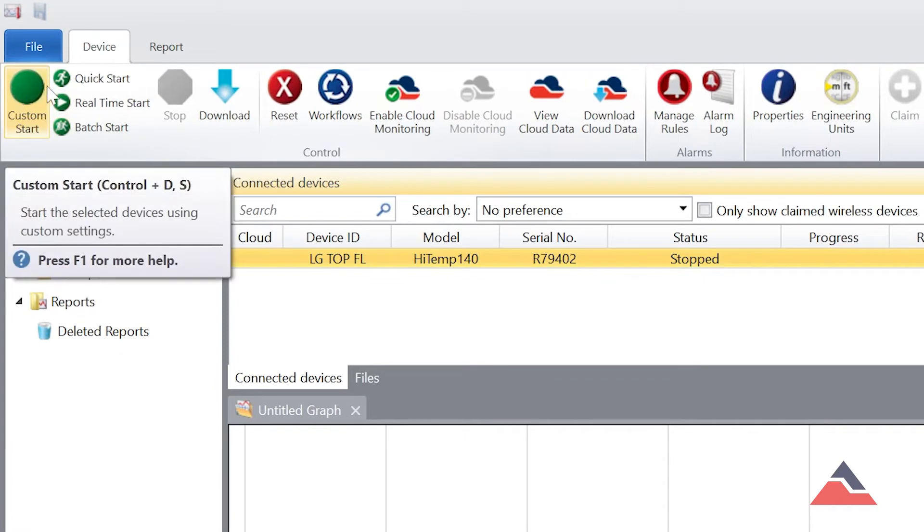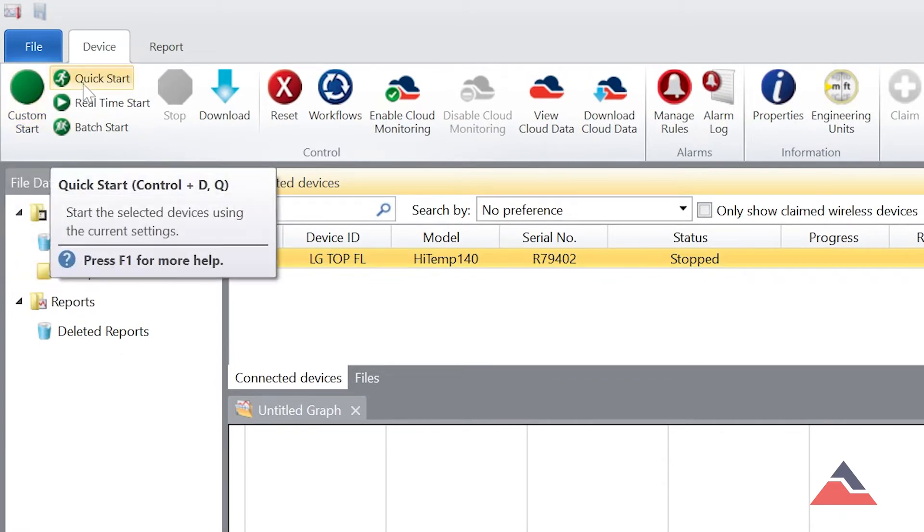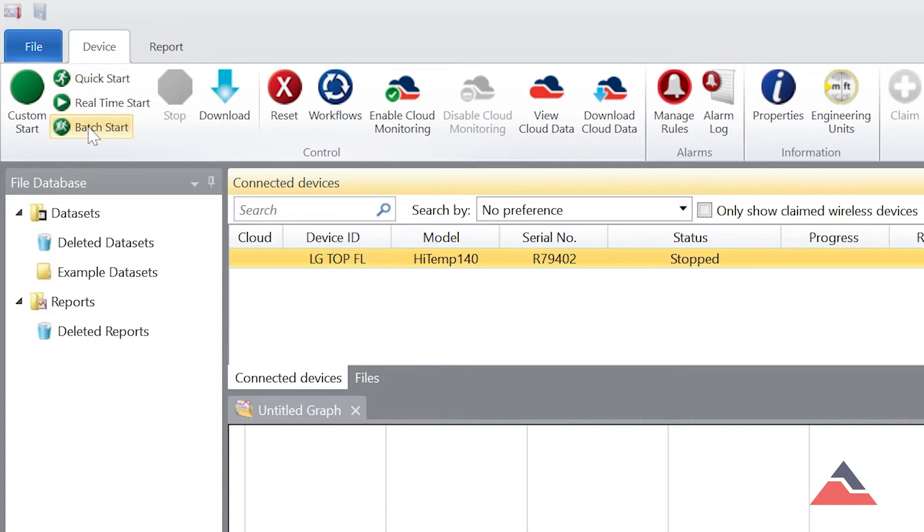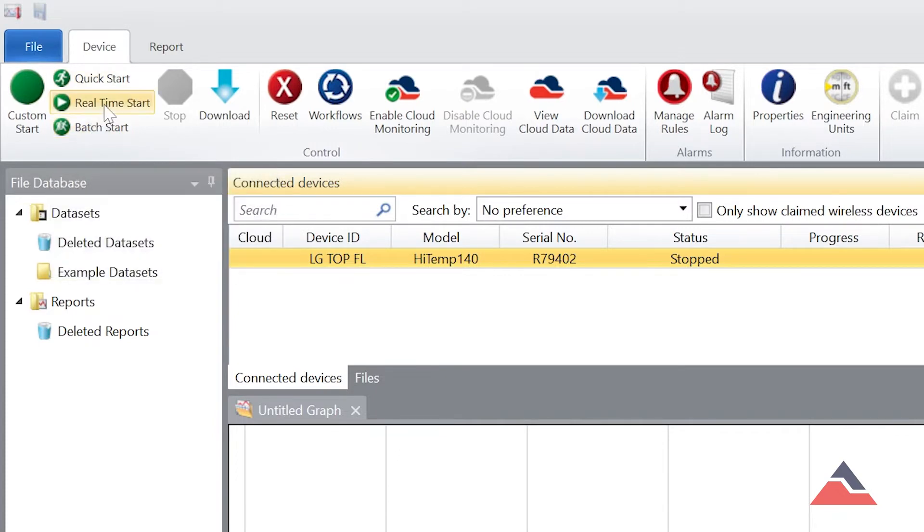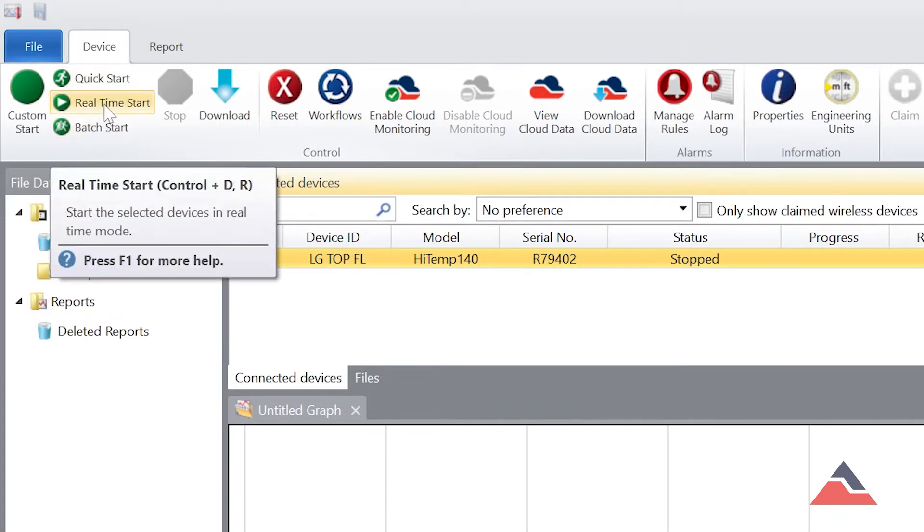The software also features Quick Start, which loads your most recent custom parameters, Batch Start for managing multiple devices, and Real Time Start, which starts recording while the logger remains connected to the computer.